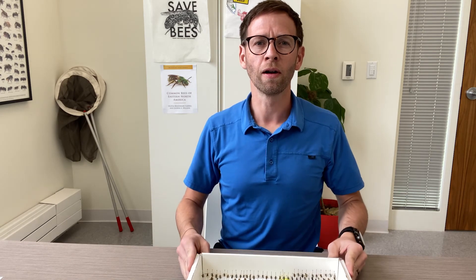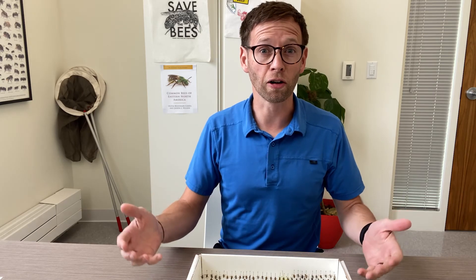Hey everybody. Today I wanted to talk about how I prepare bee specimens for other uses like photography or for identification, things like that.